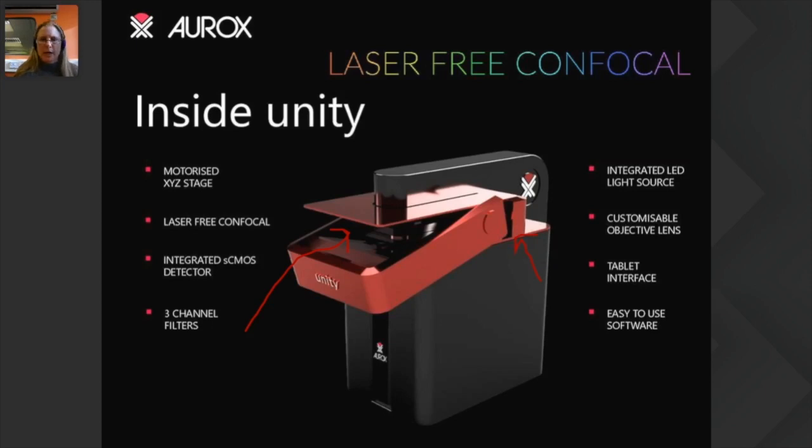What else do we have? Can microfluidics be mounted on the system? That's definitely a plan. We have the ports for the CO2 connections. So if somebody wants to talk to us about microfluidics, then we can definitely look into that. It's not something that's supported just yet, but I think in this case we'll probably be looking for some sort of partnership. If there is a company that wants to provide that as part of our package, that's perfectly reasonable.